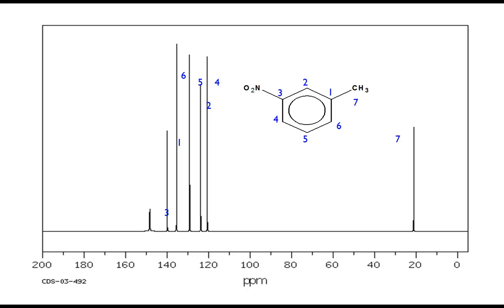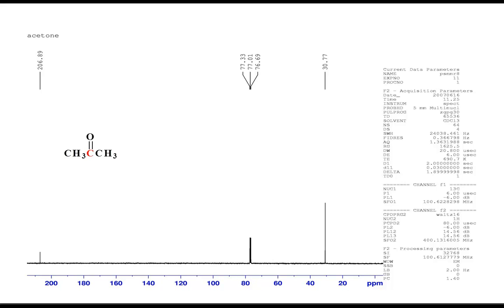So anyhow, if you are in carbon NMR, just focus on carbon. If you are in hydrogen NMR, just focus on hydrogen. Only when you have coupled NMR spectroscopy, off resonance carbon 13, then you have to consider the carbons and hydrogens together. Otherwise, they are pretty different from each other. You don't have to worry about the other one while you are in one.